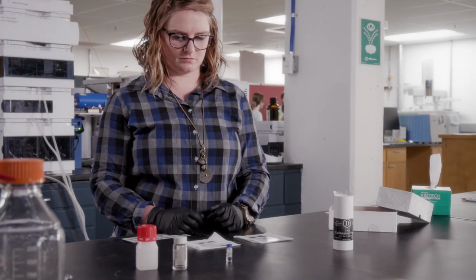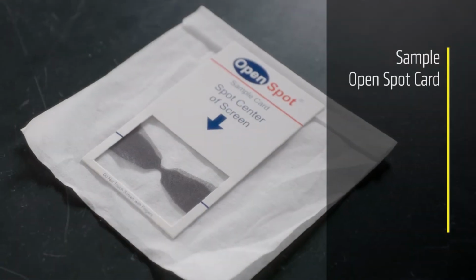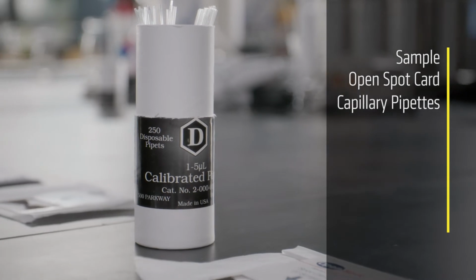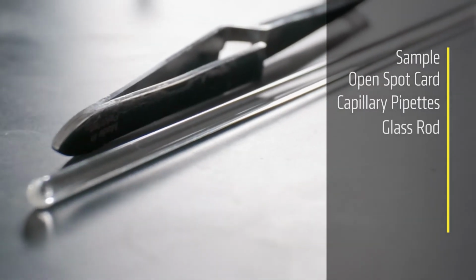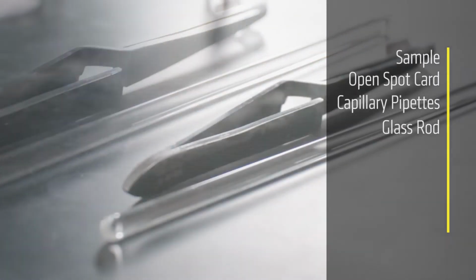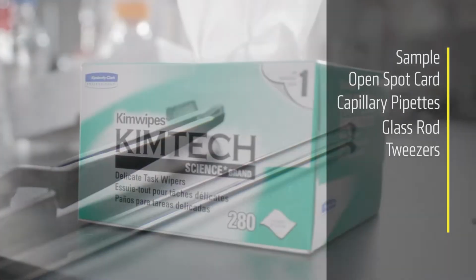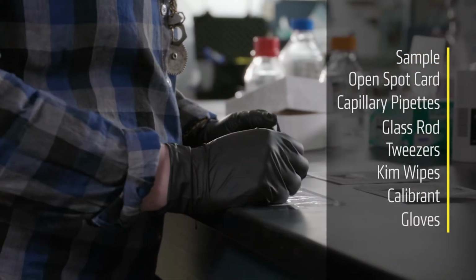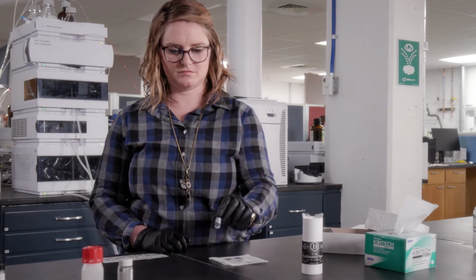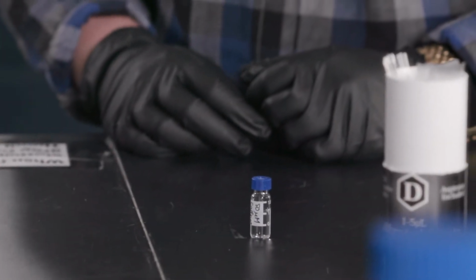To prep your DART sample for analysis, you will need your sample, open spot cards, 5 microliter capillary pipettes if your sample is dissolved, a glass rod if your sample is solid powder, or tweezers if you are analyzing the surface of a solid object, Kim wipes, calibrant, and lastly gloves. For this demonstration, we will be running a sample of 10 micrograms per milliliter caffeine.